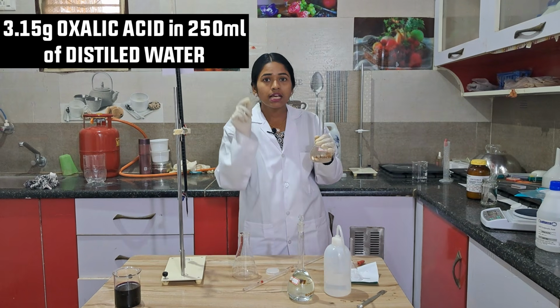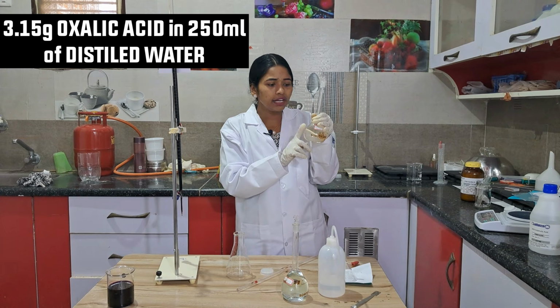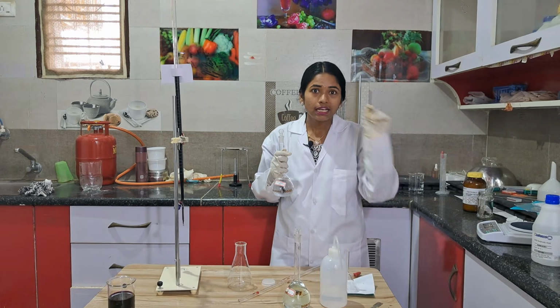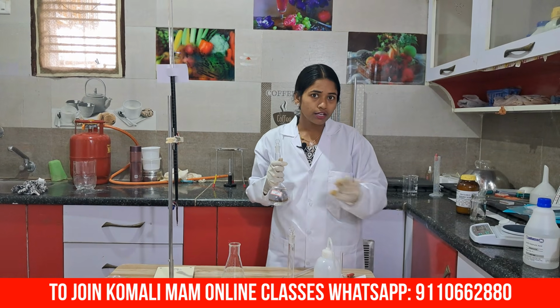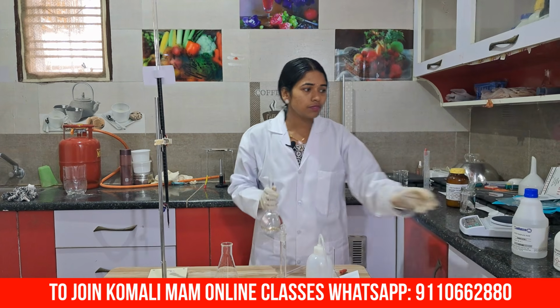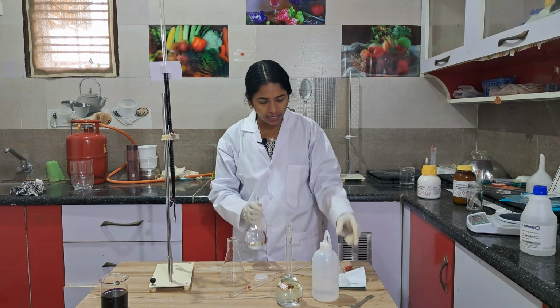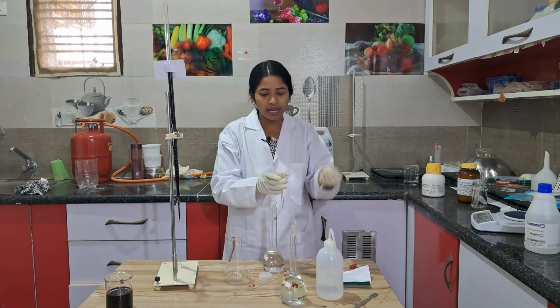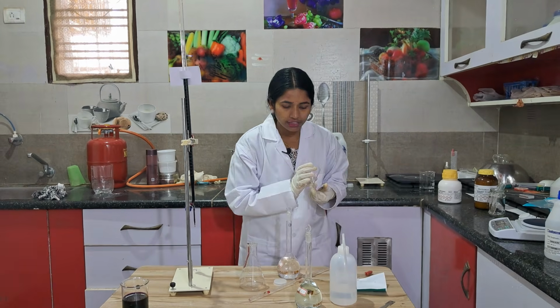I have taken 3.15 grams of oxalic acid and dissolved it. First, take the weighing machine, put one paper, keep it, and click on tare so its weight will be cleared. Then weigh 3.15 grams of oxalic acid, put it on the paper, and keep the funnel. For time saving I am not showing this. Add it, then add distilled water, make up the solution, and then shake it.